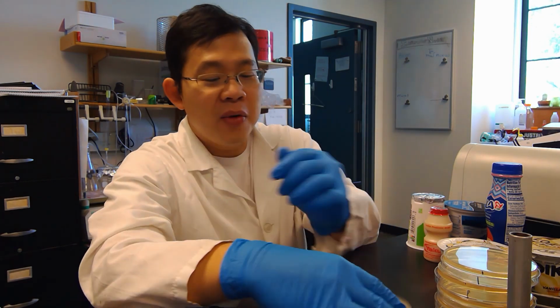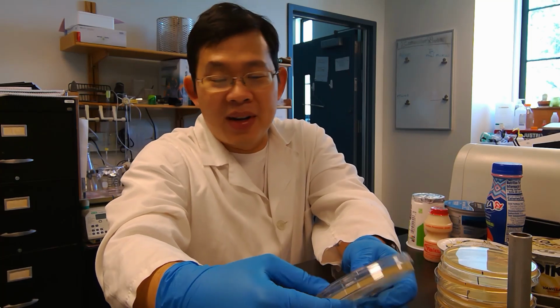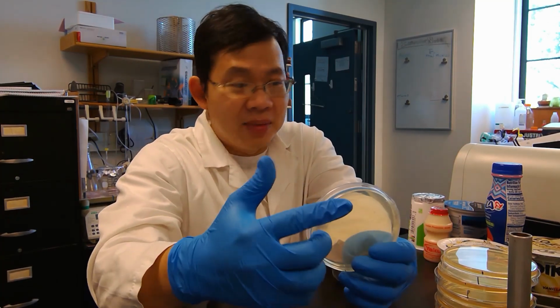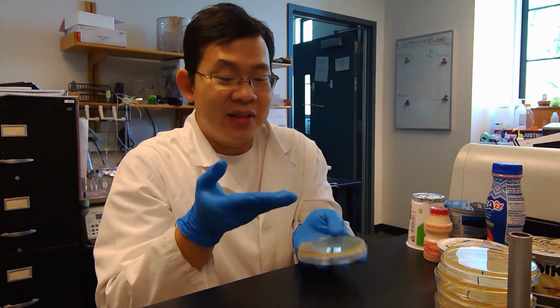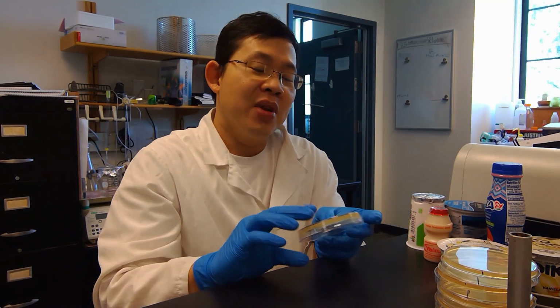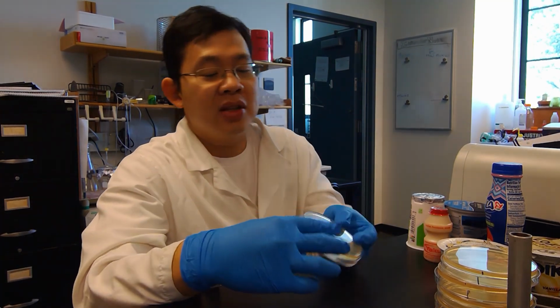Before you perform any laboratory activity, it is always a good practice to label your stuff. So here we are going to put probiotic products on the agar plates, so it is best to label them so we can identify which agar plate contains what sample, right? But before we talk about that, let me just show you.